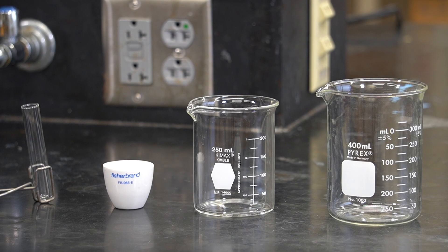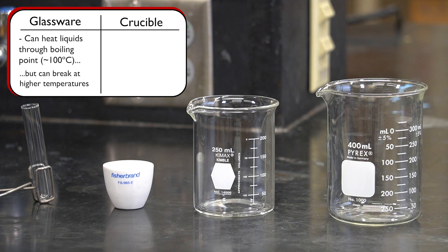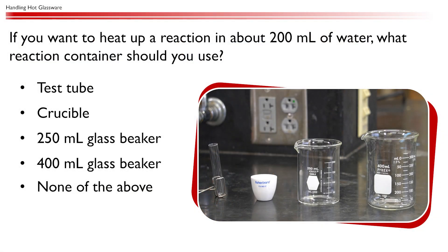Before you start, you must select the appropriate container for the procedure you are performing. Standard glassware such as beakers and test tubes work for heating liquids up through the boiling point of water, but can break at higher temperatures. A ceramic crucible is required for higher temperatures and continuous heating over an open flame or in the oven. Plastic containers are never appropriate for heating.